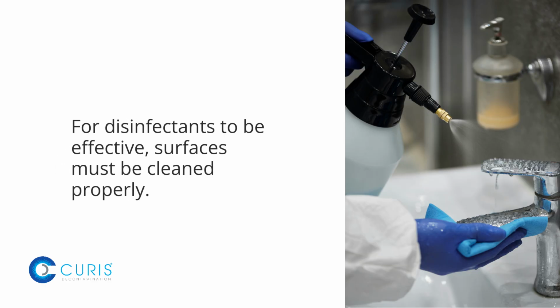Effective lab disinfection starts with structure, not guesswork. First, surfaces must be cleaned properly. Dirt and organic material can block disinfectants and reduce efficacy. Next, labs should identify the most likely microbial risks in their environment, so disinfectants can be selected intentionally, not generically.